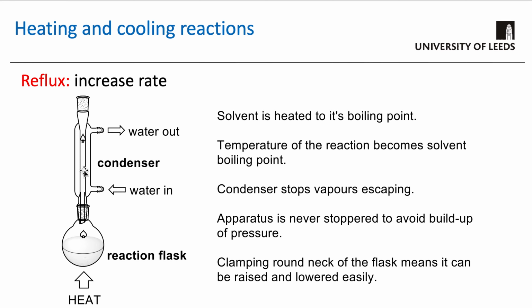And so this is the basics of how we set up and run a reflux reaction. What you have is a round bottom flask, and in there you'll have your reagents, your aminophenol, your acetic anhydride, and you'll have water in here as well. The role of water is that it's a solvent. It mixes all the reagents together.